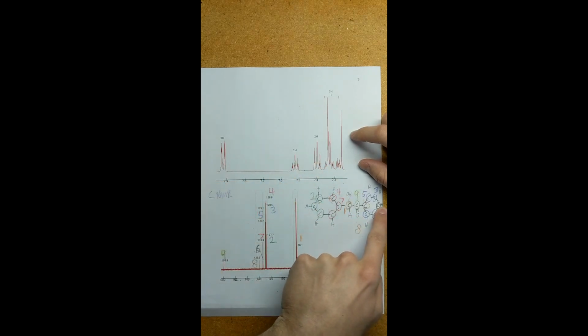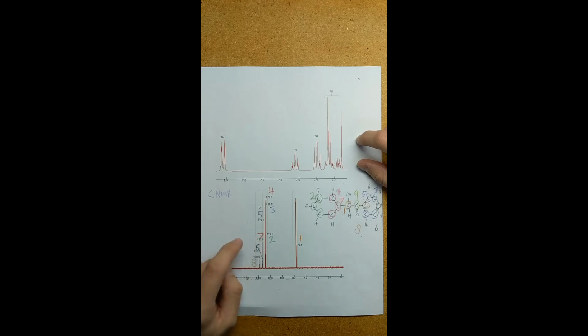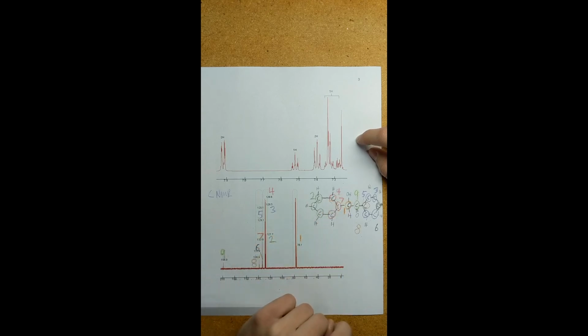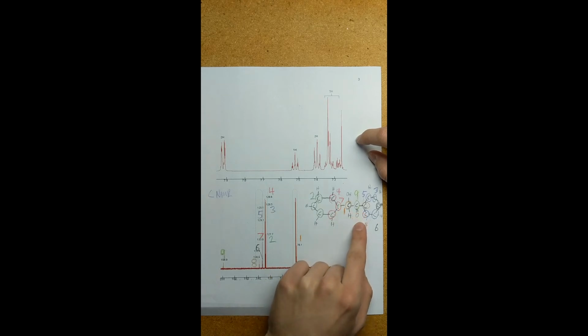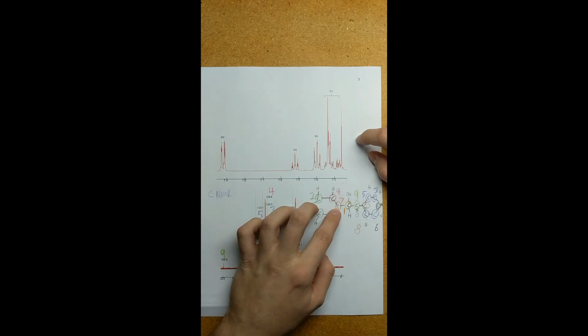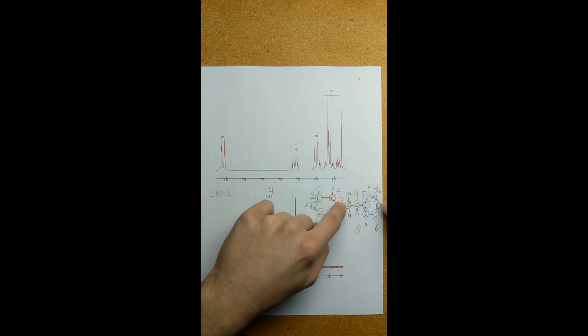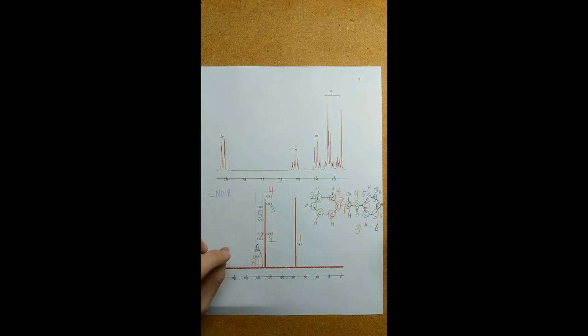So that is why this carbon right here is ranked as 6th and even more deshielded than the ones that have been shown before it. Number 7, slightly more deshielded at 133.9. I chose this singular carbon right here. That is because it is less deshielded than, say, this carbon or this carbon, for example, but it is more deshielded than the ones that have been shown previously because it is coming in towards these 2 oxygen groups.